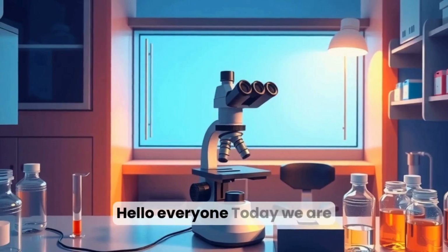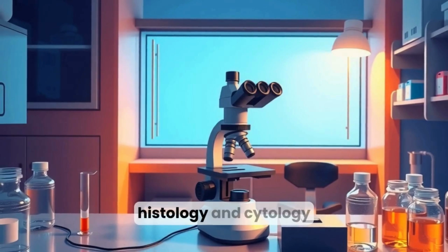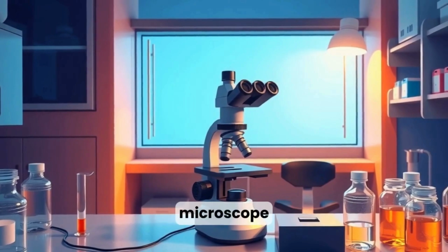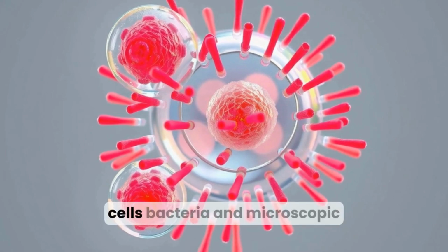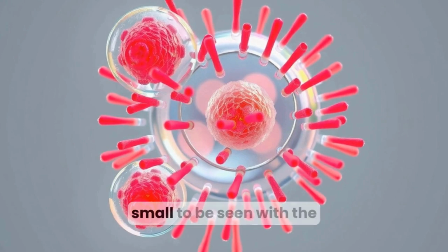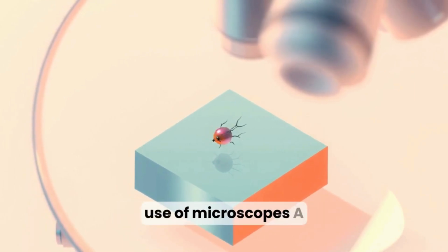Hello everyone! Today we are going to explore an essential instrument used in biology, histology, and cytology laboratories, the light microscope. Let us begin by thinking about a simple question. Many biological structures, such as cells, bacteria, and microscopic tissue components, are too small to be seen with the naked eye. So how do scientists observe them? The answer lies in the use of microscopes.